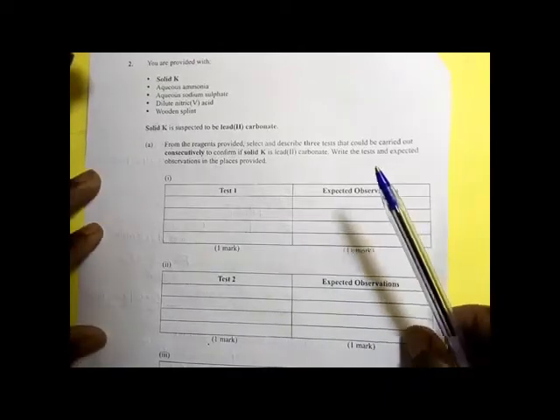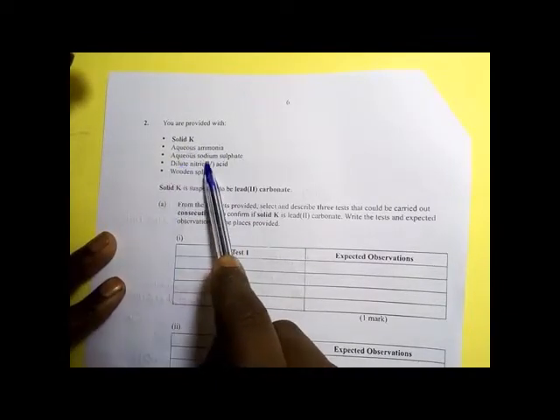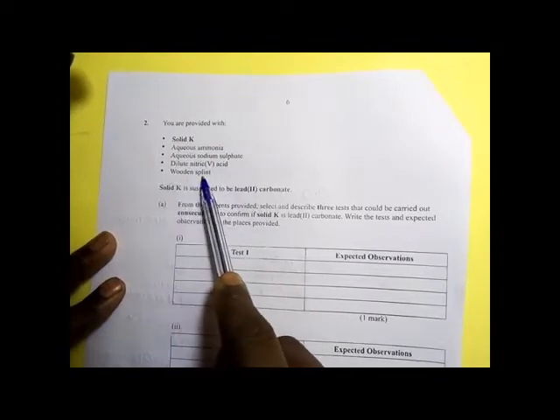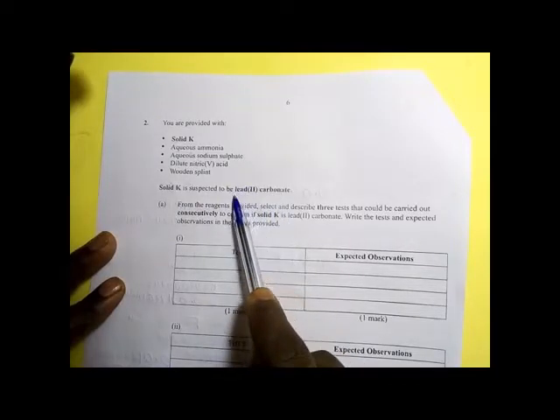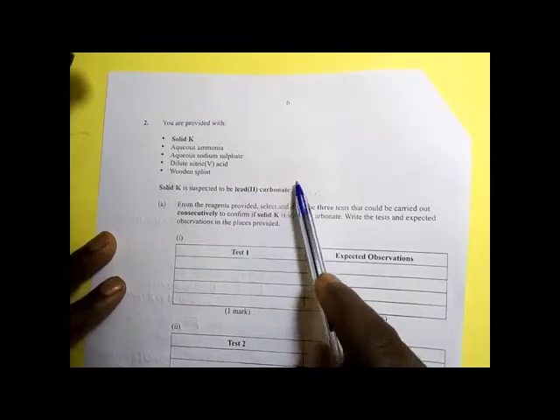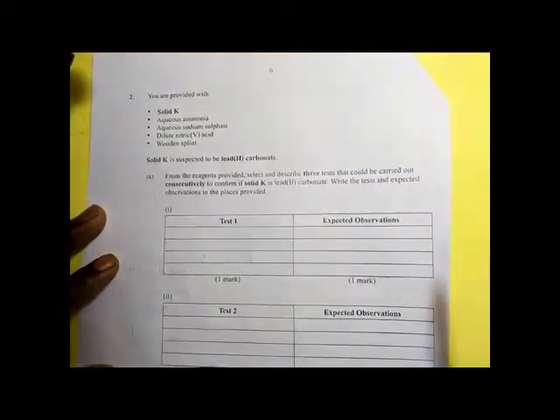So let us look at the question itself. You are provided with solid K, aqueous ammonia, aqueous sodium sulfate, dilute nitric acid, and then a wooden splint. Solid K is suspected to be lead(II) carbonate. So you should understand the behavior of carbonates with the acid. Whenever you add an acid to a carbonate, you expect effervescence. If you don't understand that kind of information, then you are likely to be left out in this.